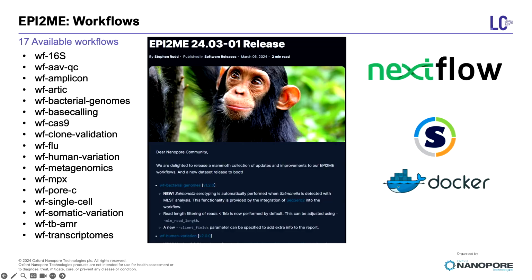The EPI2ME team create workflows and infrastructure to make analyzing Oxford Nanopore sequencing data easy and accessible to everyone. We've created workflows into which you input your basecalled reads and run, and they will output reports to help you make sense of the results. We use the workflow manager Nextflow to help manage computational resources and to get you from basecalled reads to answers efficiently. And we use containers like Singularity and Docker to ensure reproducibility of results and to manage external packages.